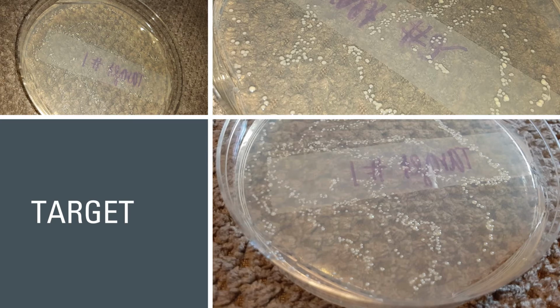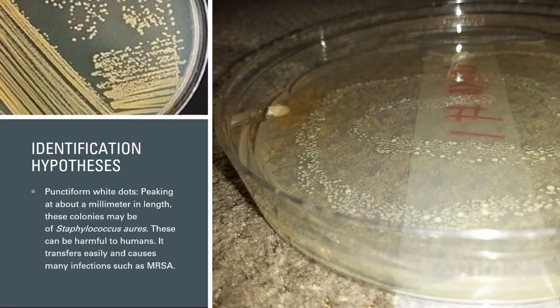Target, we have really not much variety at all, which I think I like. But there are quite a few colonies, small little colonies about a millimeter in size. And as a little fun bit of this experiment, we decided to figure out which bacteria is which, if possible, in order to gauge how deadly some of they could be. Because, like, say, Walmart, we saw had so many bacteria. If none of them were harmful, and say, Target, these ones were harmful, then there's an issue there.